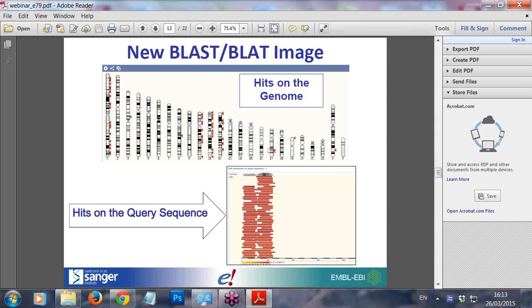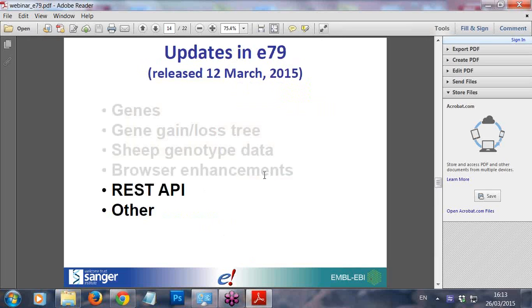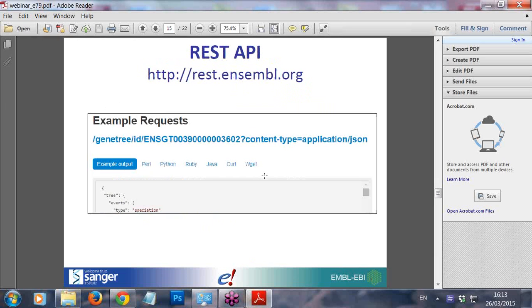Now I want to talk about the REST API and the updates there. The REST API is a quick and easy way to access Ensembl data, and you can use multiple languages like Perl, Python, Ruby, or Java. You don't even need to know a programming language — you can use wget, curl, or just type a modified URL to get something like a gene tree or sequence. Go to rest.ensembl.org where there are user docs showing you how to use it with examples.